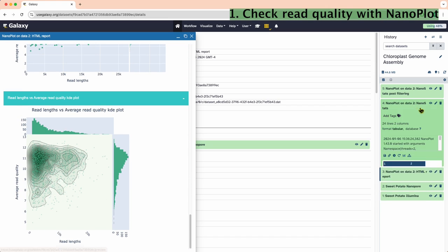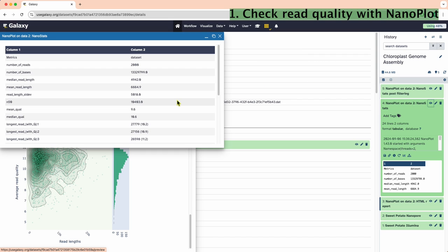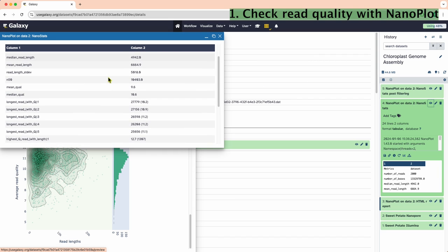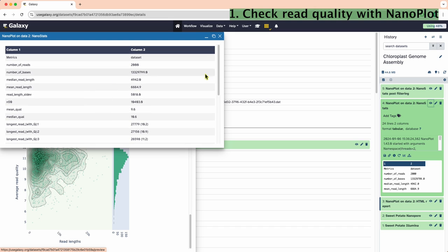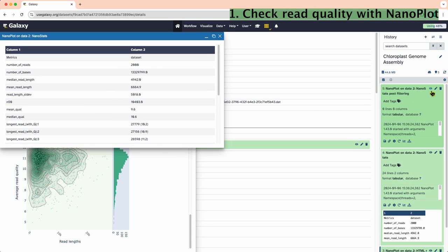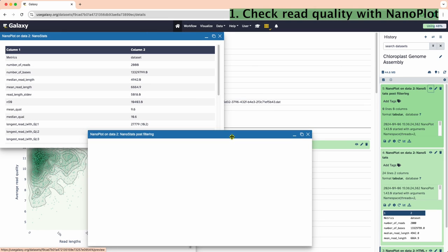We have a shorter version of the report in the form of NanoStats. Convenient, right? NanoStats post-filtering file is empty for this run.